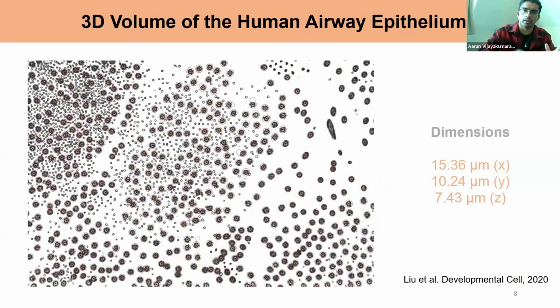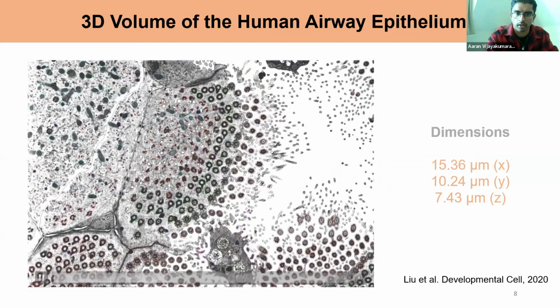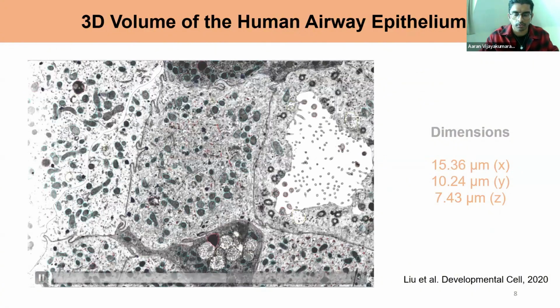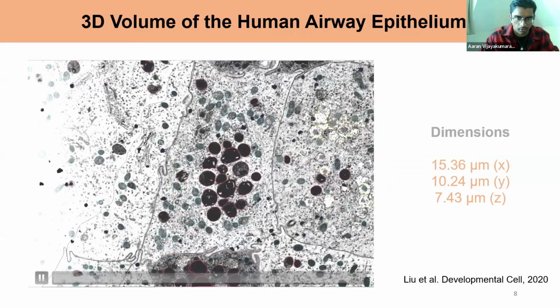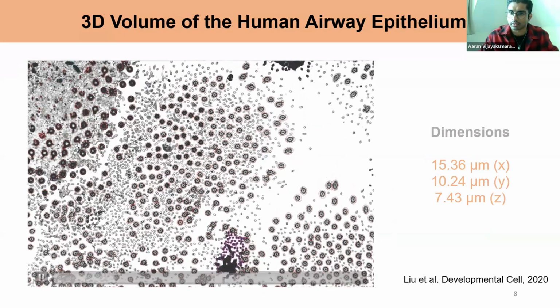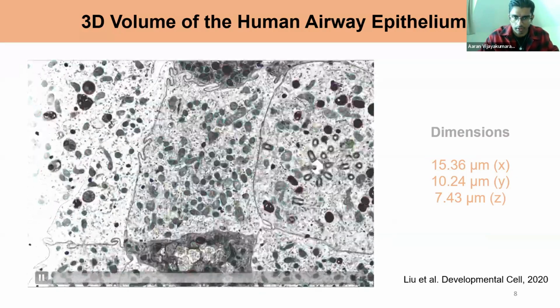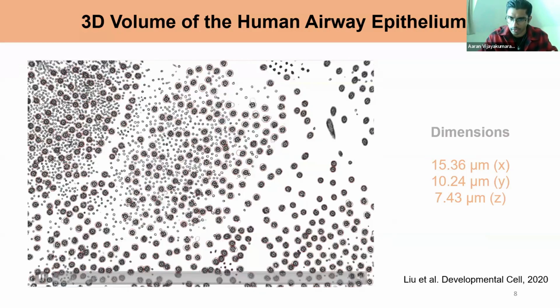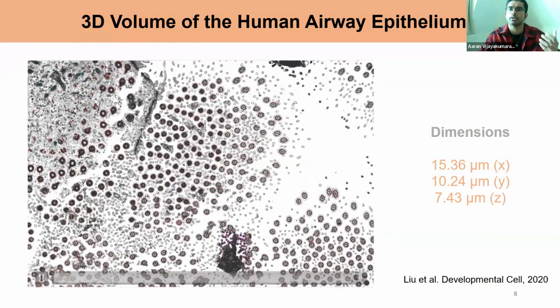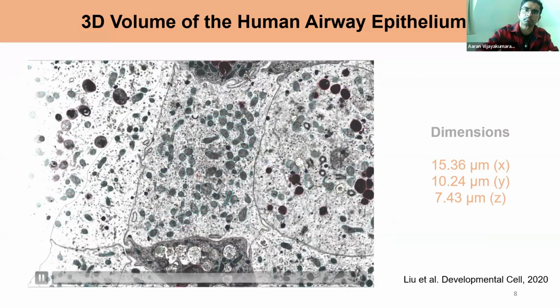And so this was one of the first data sets that I was tasked with segmenting. And we can see we have the outer cellular space in white, and we're going deep into the cell. And again, I was tasked to identify every single structure that I could find and segment it. And it's just by this view, it provides the beauty of what volumetric electron microscopy can give us. It gives us this unbiased perspective of the tissue and cellular organization of that airway epithelium.